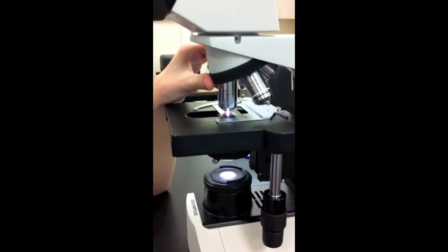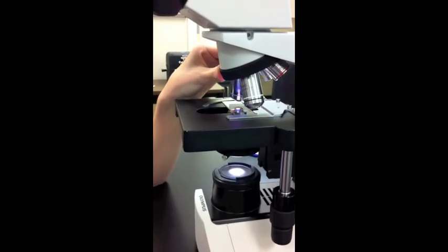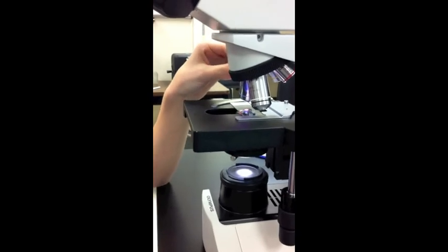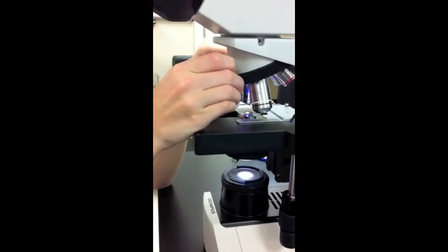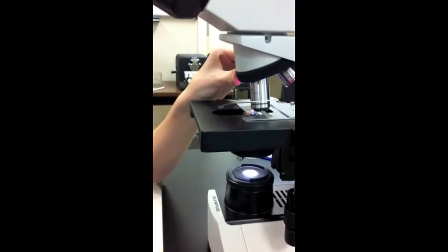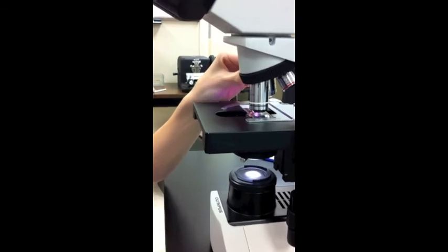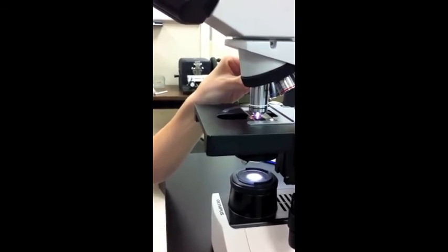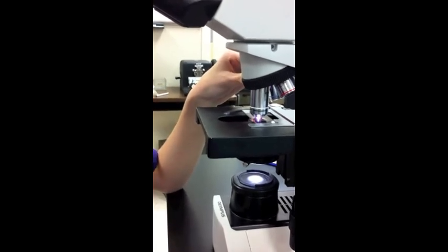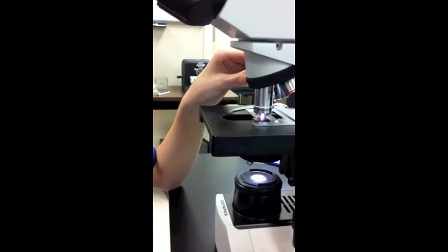Fourteen, rotate the 40X objective clockwise until it and the 100X objective are straddling the specimen. Place a drop of immersion oil directly onto the slide, then click the 100X objective into place. The 100X objective will make contact with the oil and the slide. Do not worry about breaking it because it has a spring-loaded tip. Do not lower the stage to put the oil on the slide. This will only knock your image out of focus.